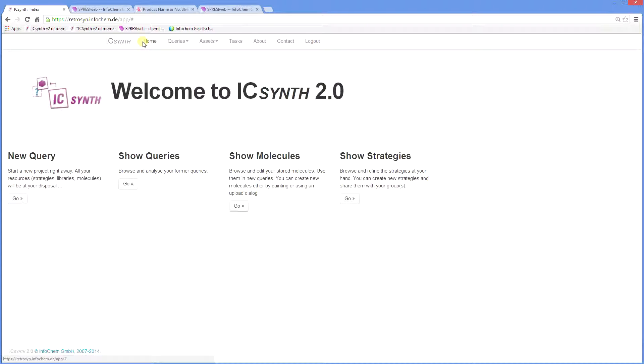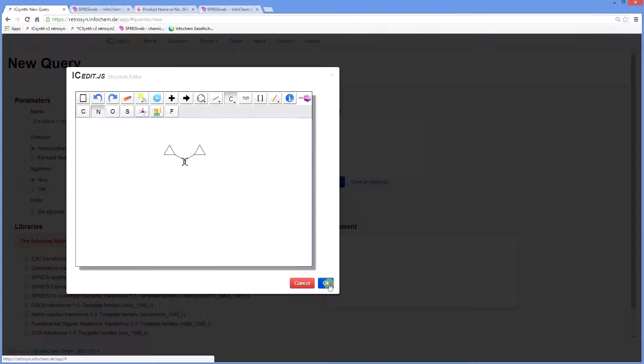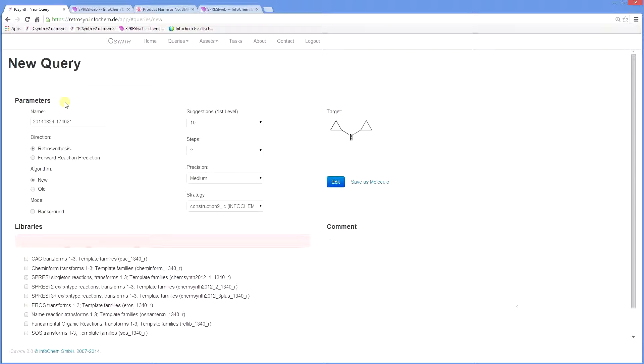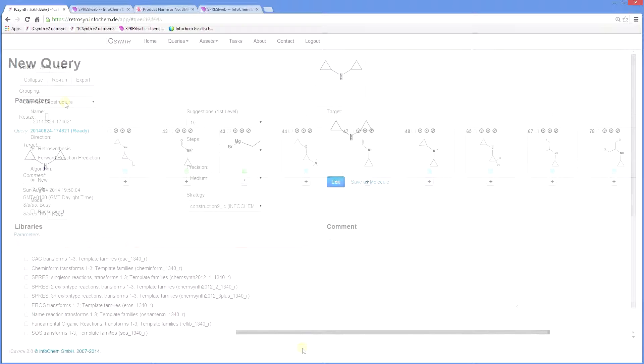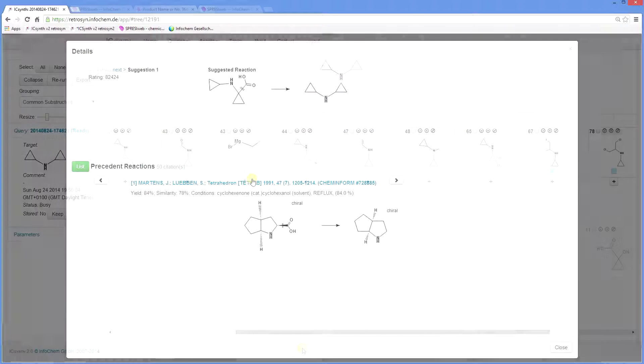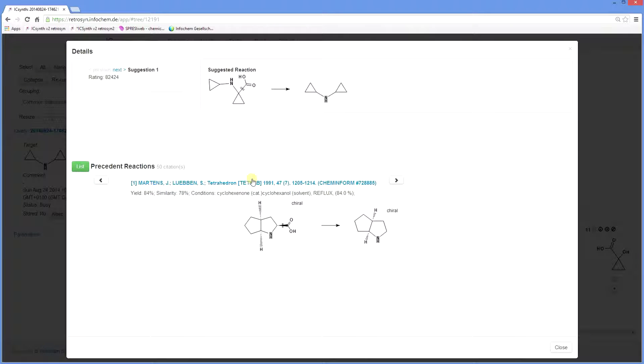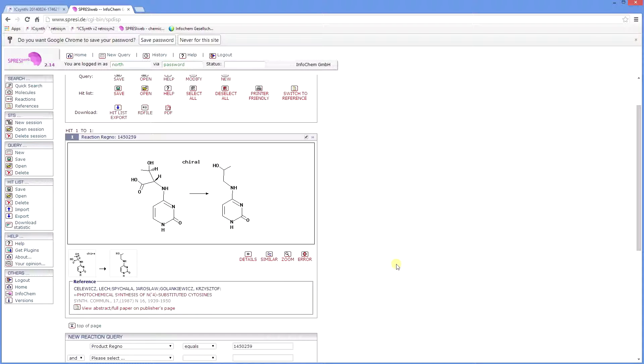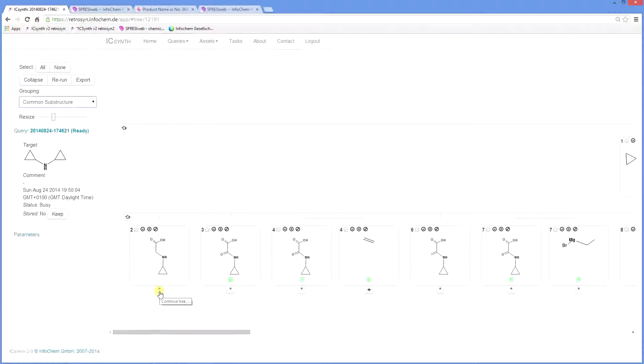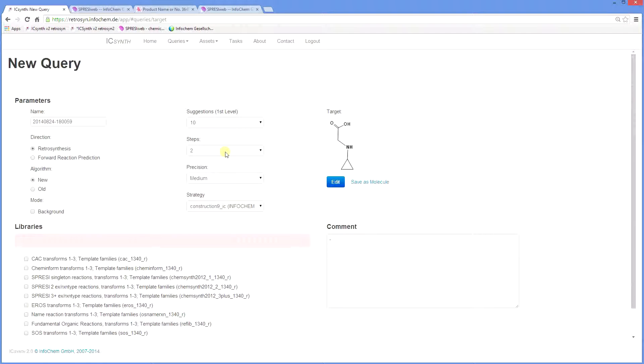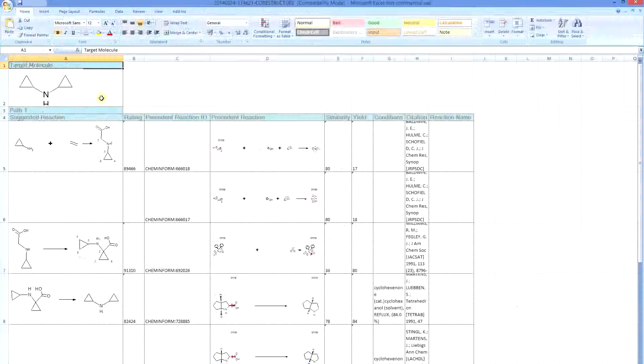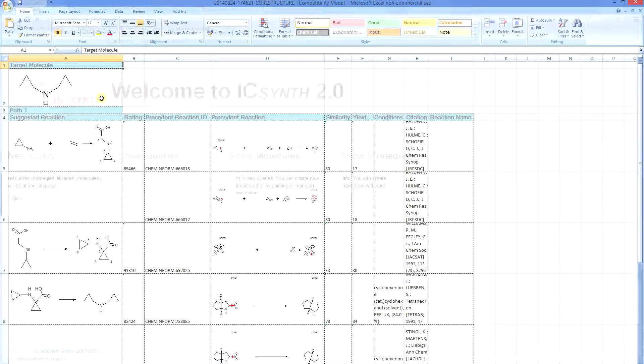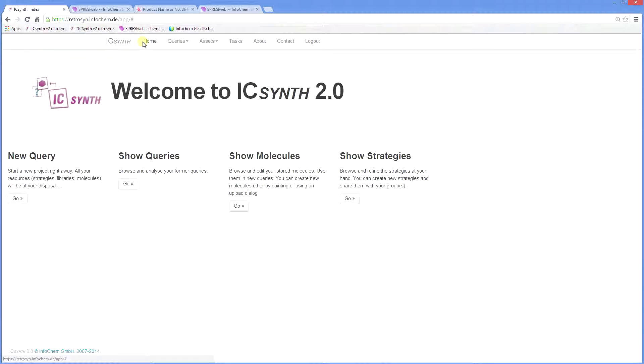So to sum up, ICSynth is intuitive to use. Firstly, draw your target compound. Select your search parameters, the default options being there to help you. Then evaluate the tree output. Further analyze the nodes on the tree linked to the literature reference. Continue the tree or select a node as a new target for analysis. Then choose the desired pathway. Then record or export the results.